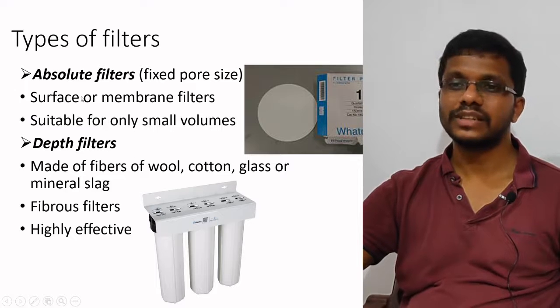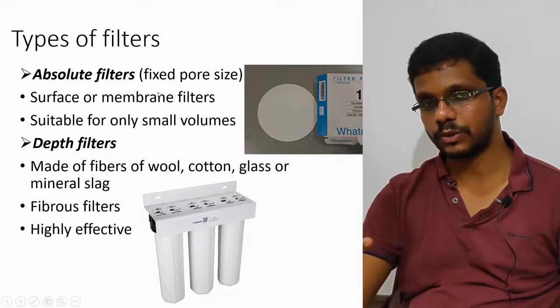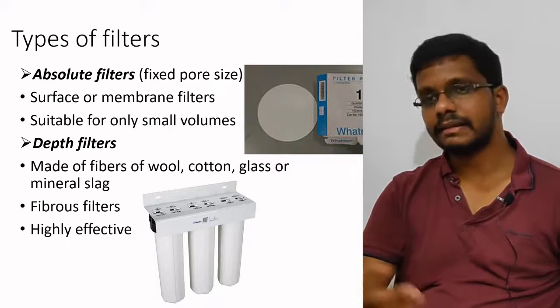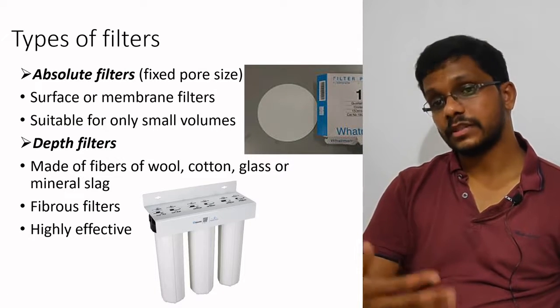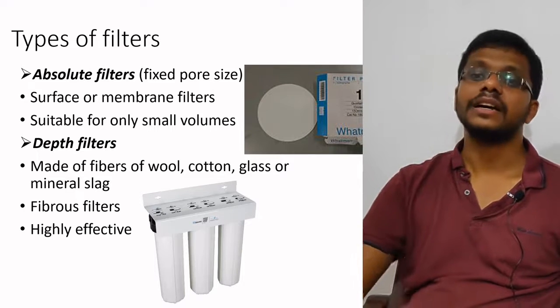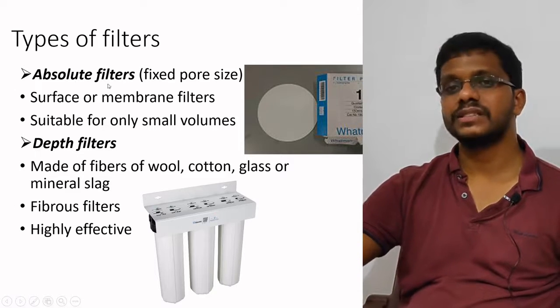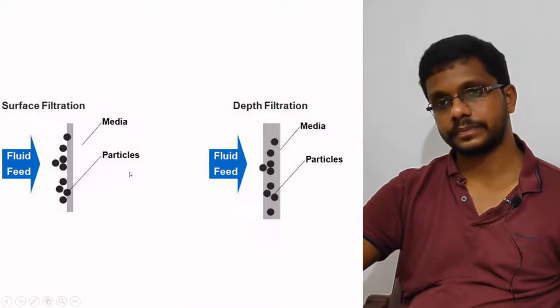Okay, absolute filters have a fixed pore size, so particles which are larger in size cannot go through. But depth filters are not like that. They are more durable, more practical, and more efficient and effective for larger volumes. Absolute filters are good, but only for small volumes.